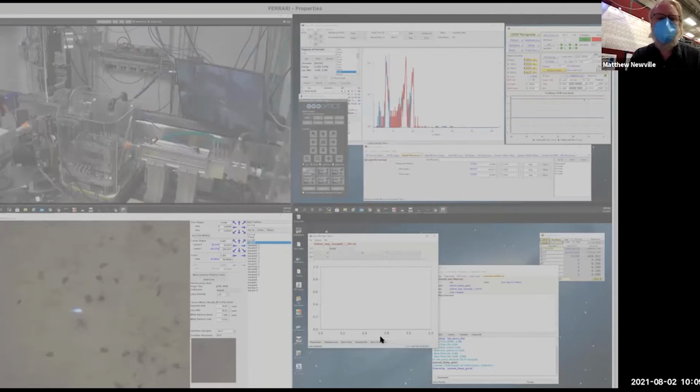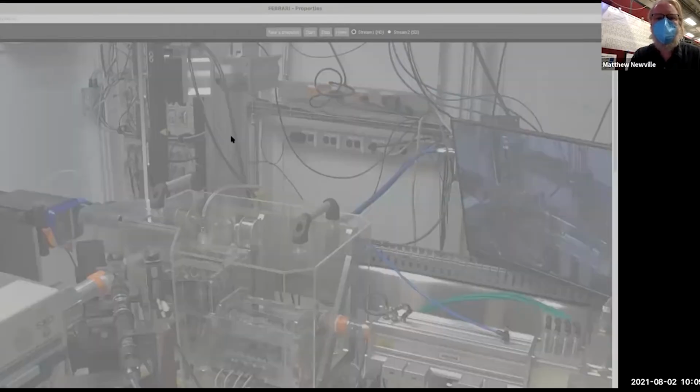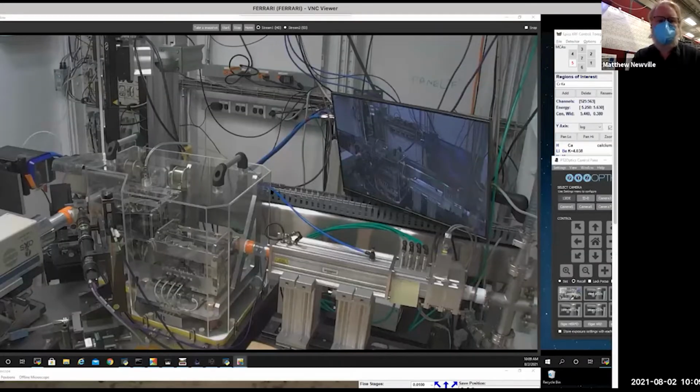The beamline controls computers, for any of you who come to the beamline, have four monitors, and I'm sharing all four of those with you right now. So in this view, you can see a camera in the station that we have on a pan tilt zoom. This is the end station of the beamline. This beamline uses an undulator X-ray source. I think that in the lectures by Steve and maybe a little bit by Grant, there's a description of what an undulator is. Actually, one of mine has a little description too.